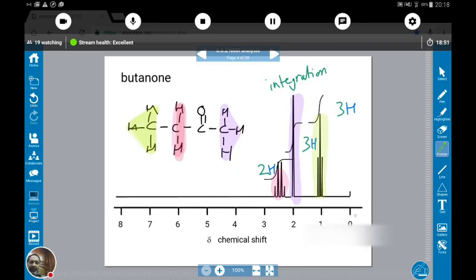Okay, in that case, what I will now try to do is explain why we have a situation in which this particular peak has actually split itself into a set of 4 smaller peaks. This one over here has not split into any smaller number of peaks, whereas this one over here has again split into a smaller set of 3 peaks. Now this is the actual part that most students find the most difficult, because explaining it is not quite easy, and it does take a significant amount of time to train your brain into figuring out exactly why the peaks have split up into smaller bits.